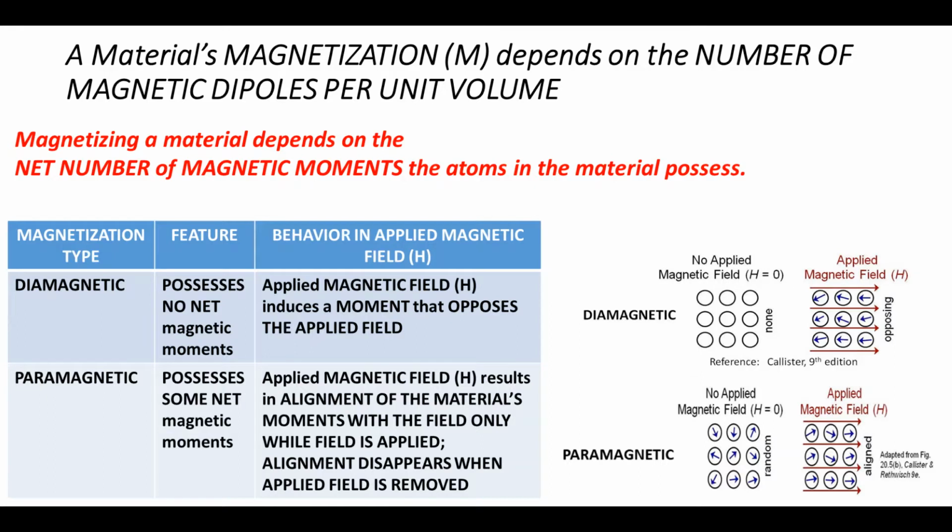The class of materials referred to as diamagnetic materials are repelled by a magnetic field. An applied magnetic field creates an induced magnetic field in these materials in the opposite direction, causing a repulsive force. Diamagnetism is a property of all materials and always makes a weak contribution to the material's response to a magnetic field.